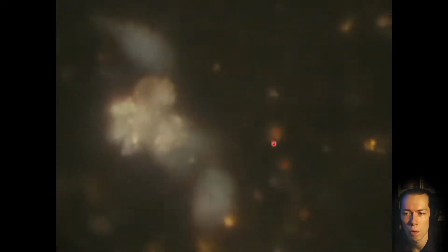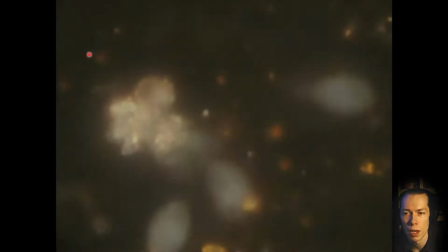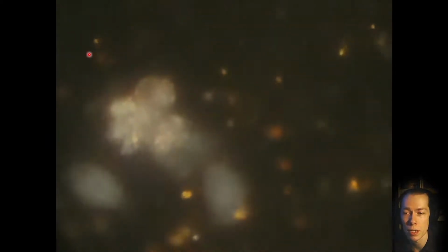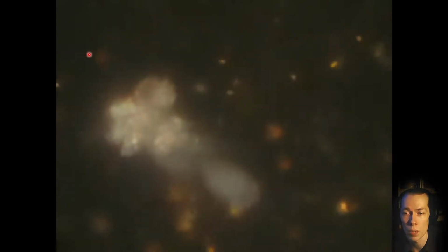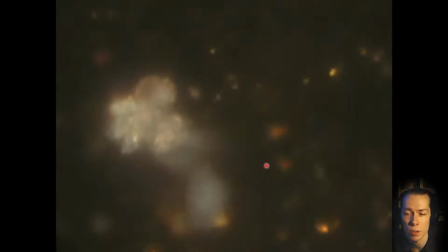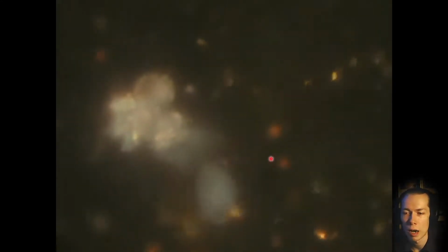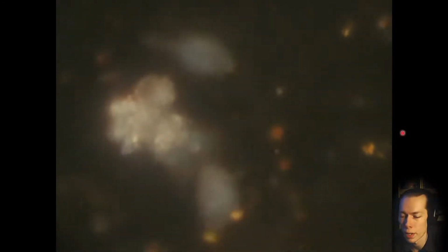And all of these yellowish dots are gold nanoparticles, aggregates of gold nanoparticles, which were visualized using a dark field technique on an optical microscope. So as you can see, it's a macrophage with some gold nanoparticles inside. But where inside? Well, no one knows.